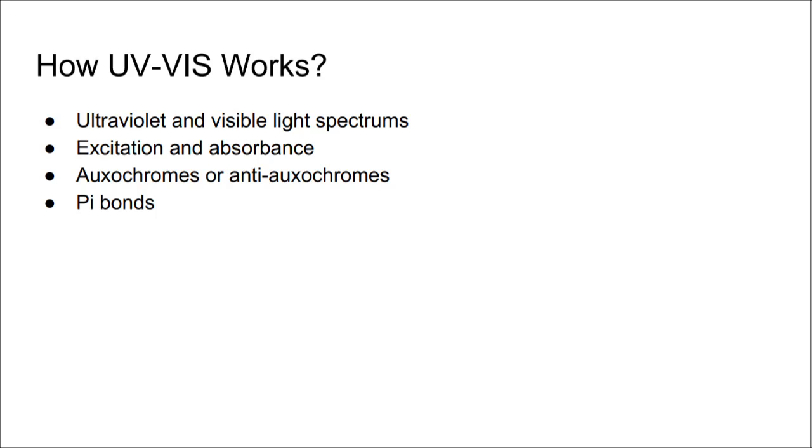Molecules that contain pi bonds are able to easily absorb UV light during the spectroscopy process, and the more easily excited the electrons are in the compound, the longer wavelengths of light it is able to absorb. This method of analysis deals with absorption spectroscopy, meaning that the machines that perform UV-VIS measure the transition that the molecules being measured make between the ground state and the excited state.